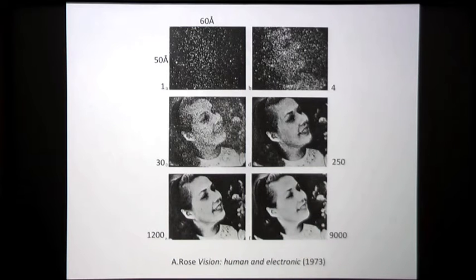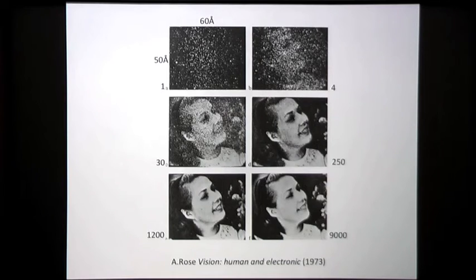And you can reliably see finer and finer details as you increase the dose. So the details of the striations in the hair and everything become apparent. So by increasing the dose with which you image, you can recover the fine details and get over this noise limitation of quantum limited imaging.